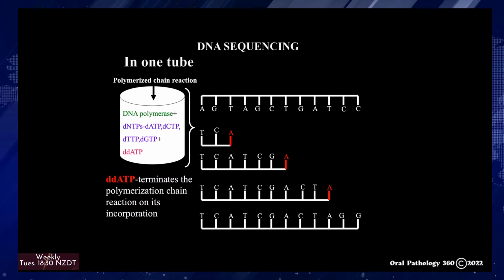This pictograph illustrates the sequencing method where the ddNTPs terminate the polymerization chain reaction on their incorporation.